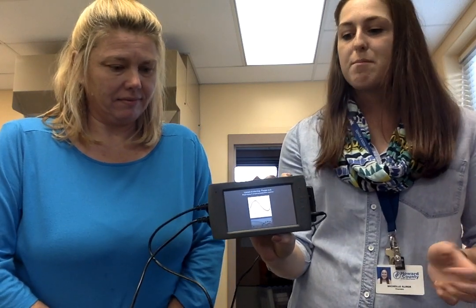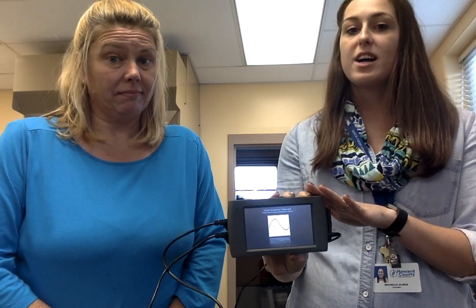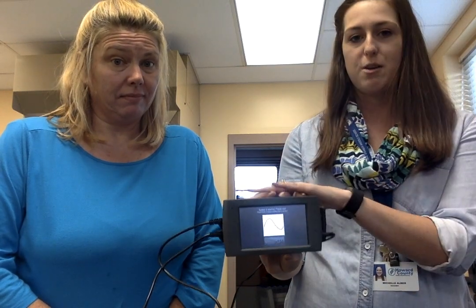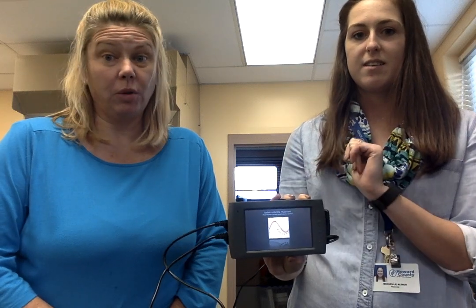Since we're working at our lab benches and these are very expensive tools, you should not place the Vernier monitor or the probes anywhere near the sink. Don't turn the water on.